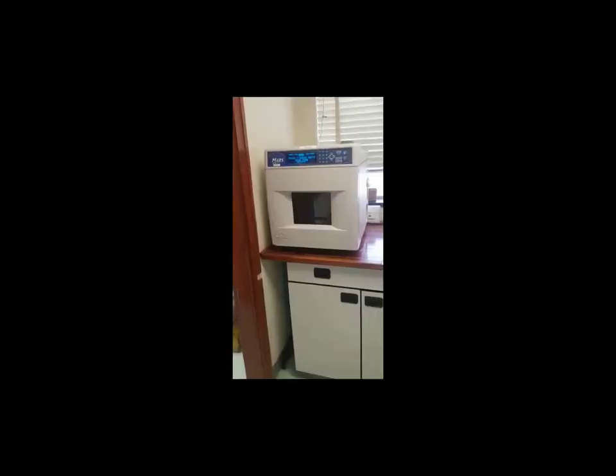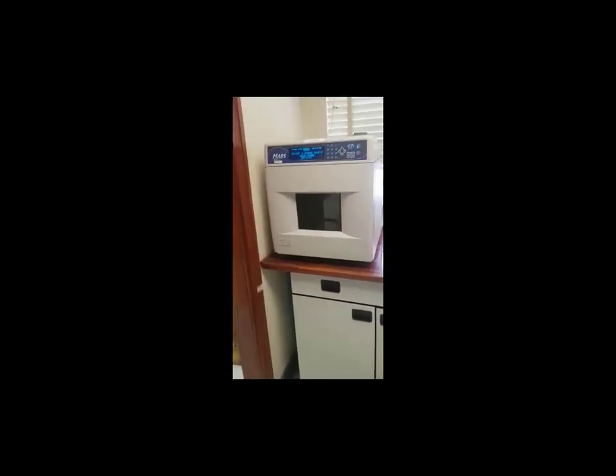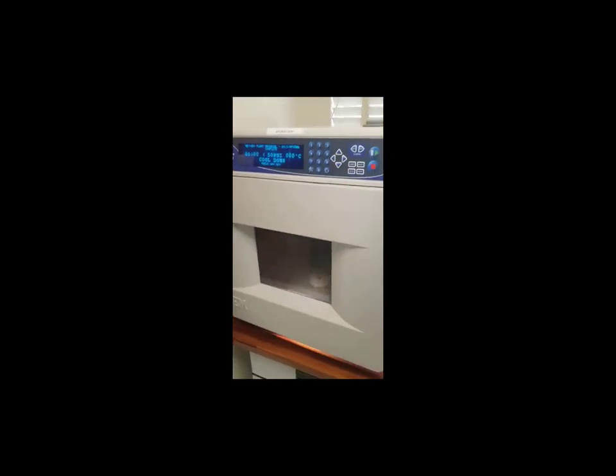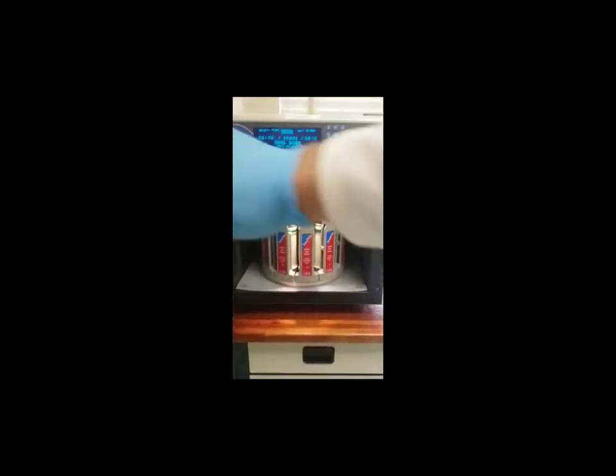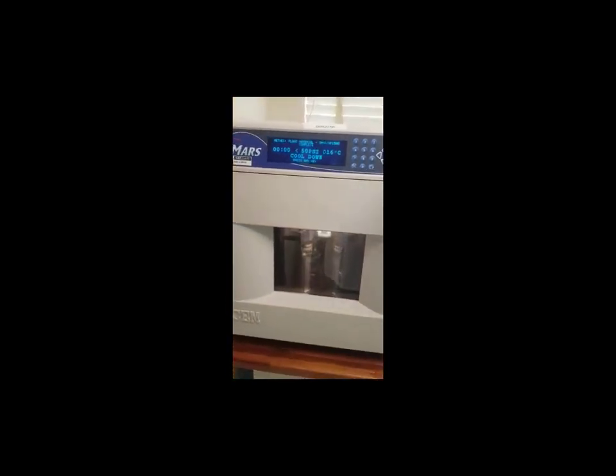The carousel is inserted into the Mars microwave digester, with the sensors to measure the temperature and pressure inside the cavity. The samples are digested according to preset EPA digestion methods.